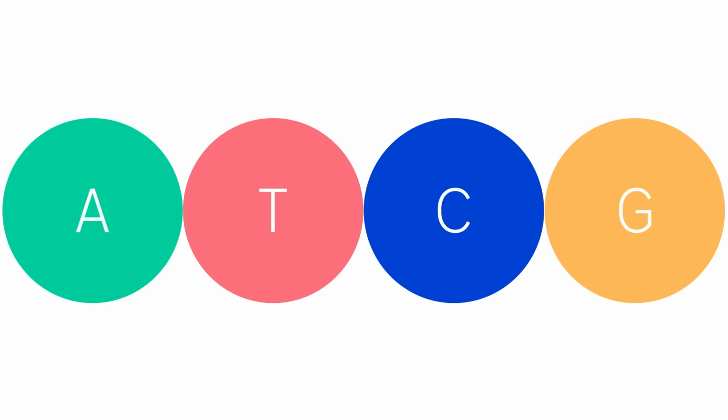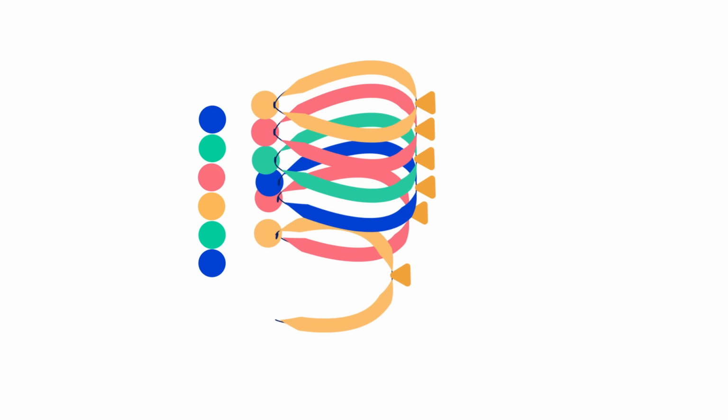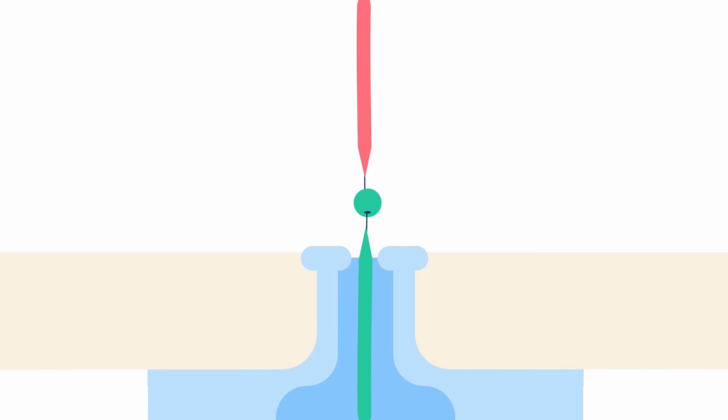Next-generation sequencing has revolutionized our understanding of biology. For years, sequencing by synthesis, or SBS, has been the most widely used technology. However, the invention of sequencing by expansion, or SBX, promises a new approach to shape the future of genomics. But what's the difference and why does it matter?